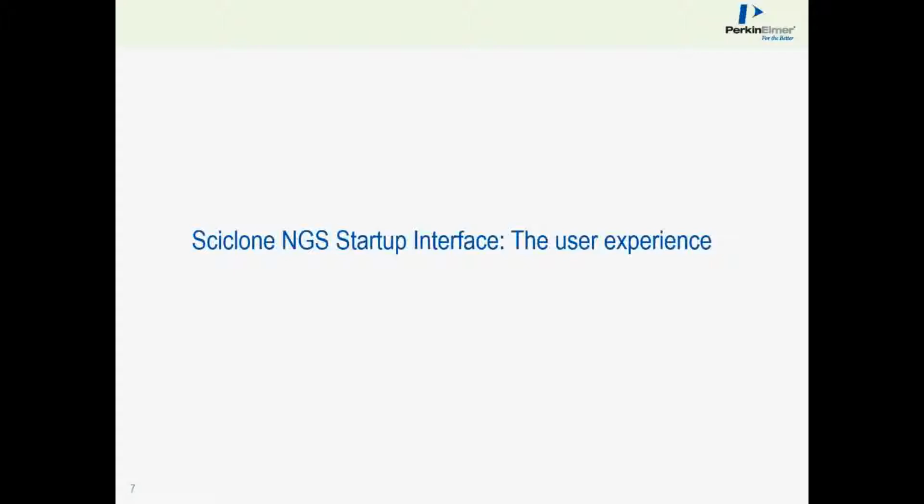Later on, I'll give you an intro to Maestro, which is the control software that we use for the liquid handling instrument, and we can create a sample method, and you can see just how easy it is to run the software, as well as to create custom applications on the fly if you needed.